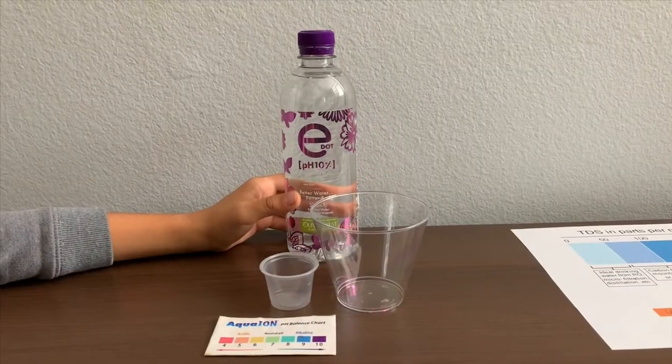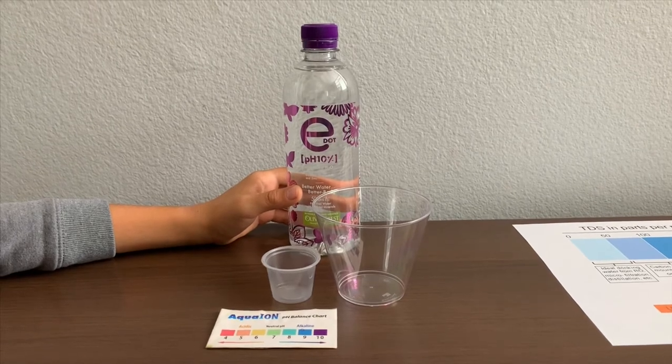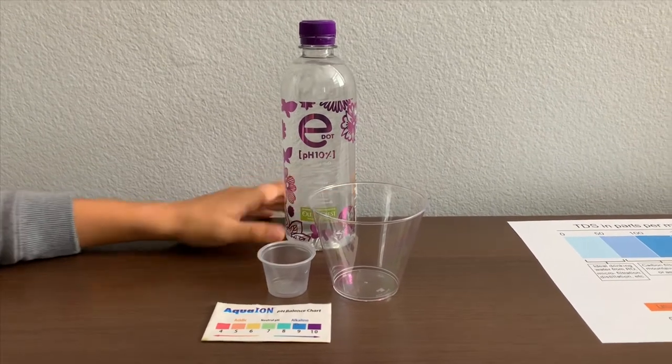We drop purified water and enhance the oil-added minerals: calcium, magnesium, and zinc. Let's test the pH and TDS levels.